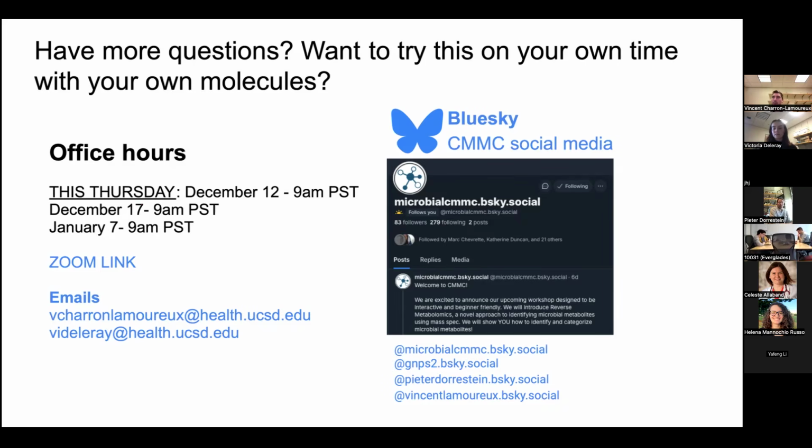We're also creating drug mass, which focuses on medication specifically. And then the other one that we're creating is sort of exposure mass. Depending on where we are, on plants or aquatic ecosystems, we're all exposed to different things that humans make.